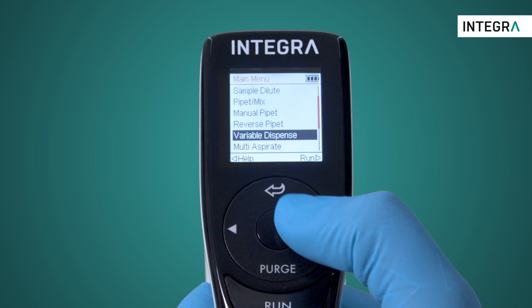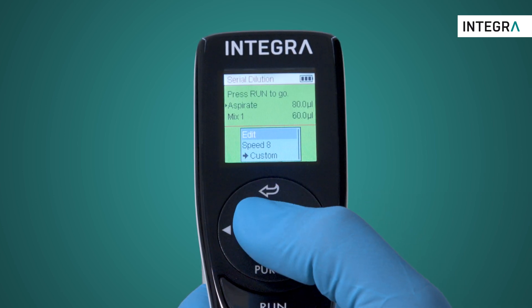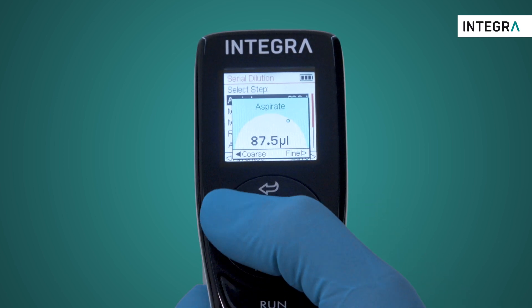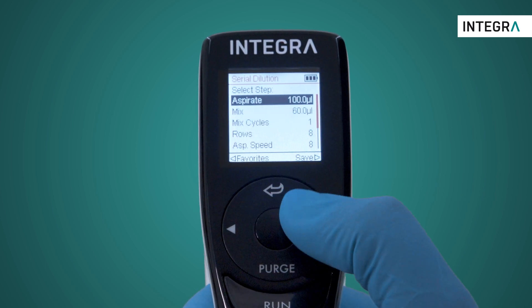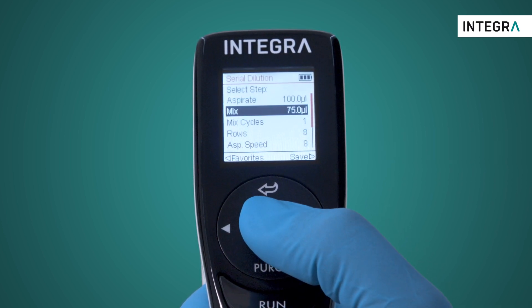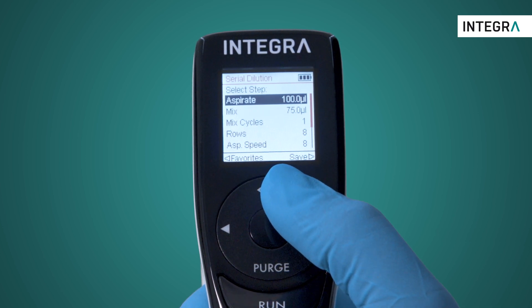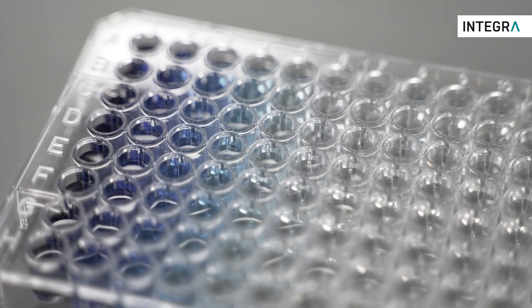To set all the factors for your dilution, enter the serial dilution program from the main menu. Here, we set the volume of the sample which is to be diluted across the plate, and then how much of the diluent and the sample together should be mixed in each well. After the mix is finished, the volume we inputted to aspirate will be aspirated again and brought to the next well, thereby giving us our dilution.